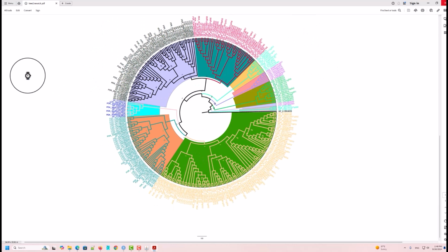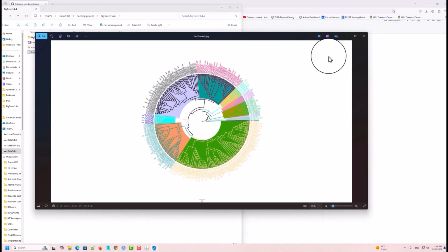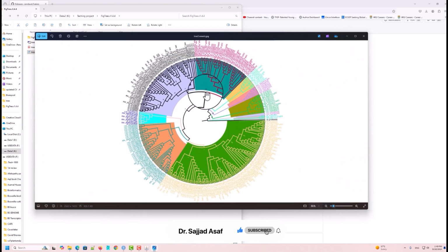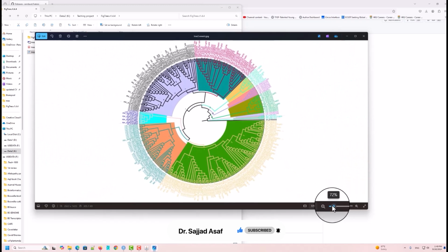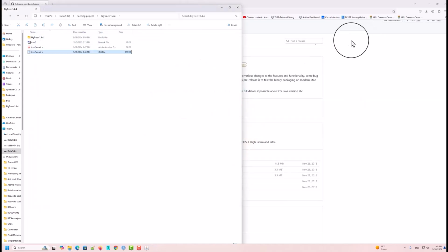And this is the other format, the JPG format. You can use this JPG format directly for publication as well, and the standard will be the same, but mostly for publication you can use SVG and PDF format, and then send to the journal. If you want to submit figures with the publication, it will be better to submit in PDF or SVG format. So this is for today.